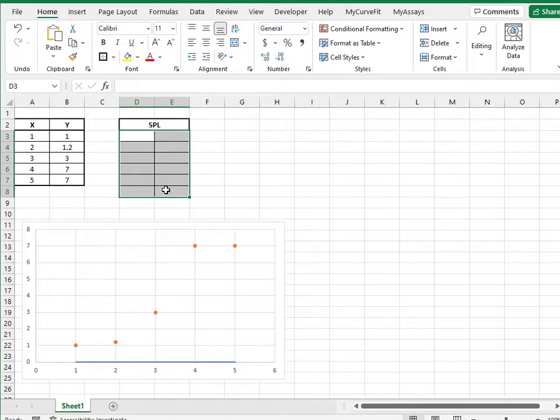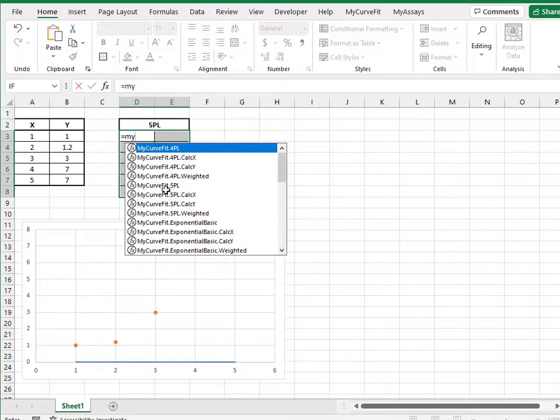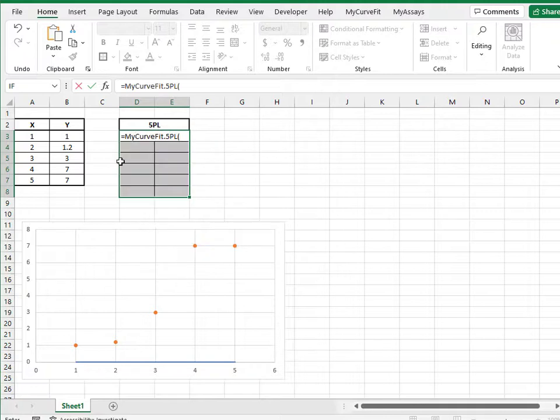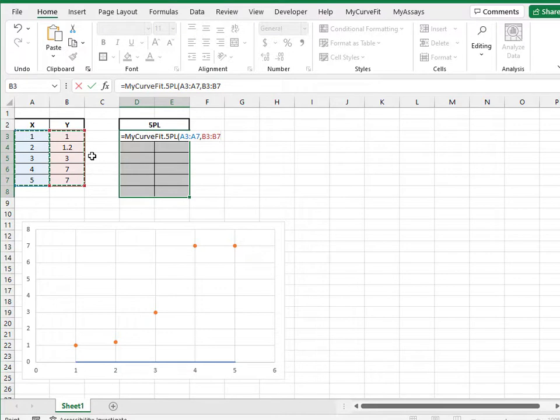Begin by typing equals MyCurveFit, and select the appropriate fit method, in this case 5PL. Highlight the X and Y values for your data points, and press Control-Shift-Enter.